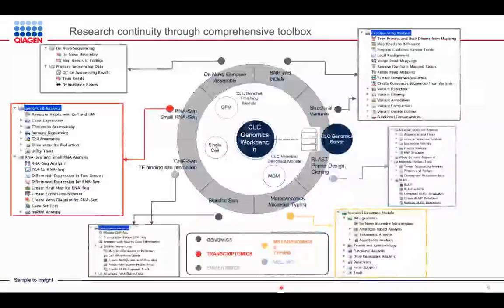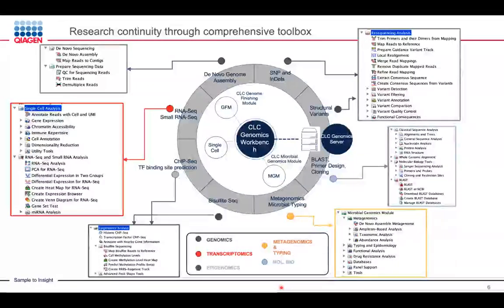I always like to give everyone a brief overview of the Genomics Workbench in the sense of what tools and functionalities it can support. And actually, I might use this time, if people can use the chat, like I asked for before, maybe for Deb to be able to capture. If we look at this set of tools, we're going to be trying to do different trainings in the upcoming months. Next month, it wasn't on the list, but I'm going to focus on doing some ATAC-seq type of single cell analysis. And so if we look at this list of functionalities, if there's anything that really seems interesting to you guys, if you want to jot that down in the chat, that would be wonderful.